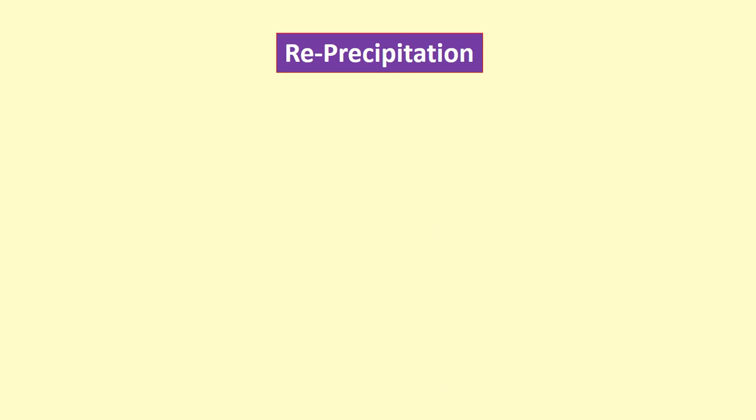Then after reprecipitation, the compound that was soluble in the acid, phenol or base solution comes out again. Reprecipitation is an important thing; otherwise, if there is no reprecipitation, it is not considered as that particular type of acid, phenol, base or neutral. Step by step we can check.